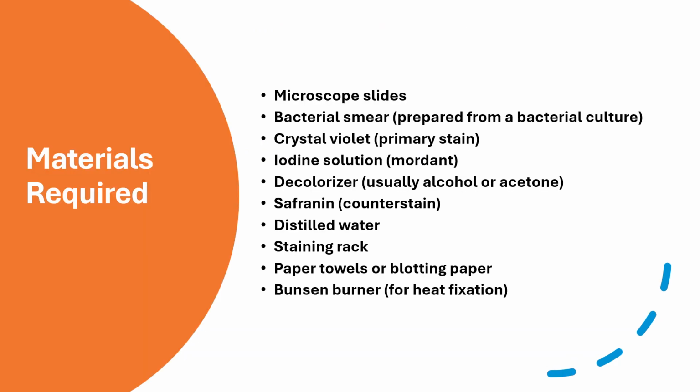Materials required: microscopic slide, bacterial smear, crystal violet as the primary stain, iodine solution as the mordant, decolorizer, usually alcohol or acetone, safranin as the counterstain, distilled water, staining rack, paper towel or blotting paper, and a Bunsen burner for heat fixation.